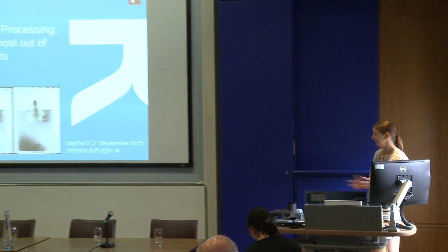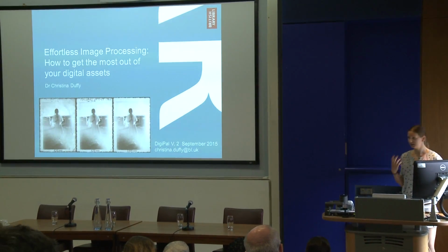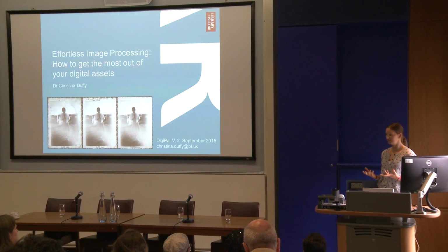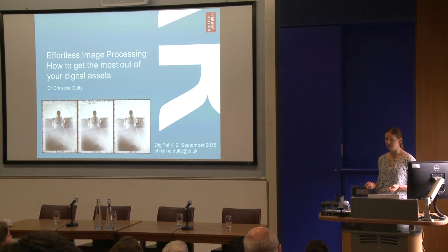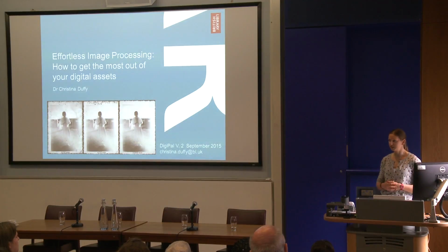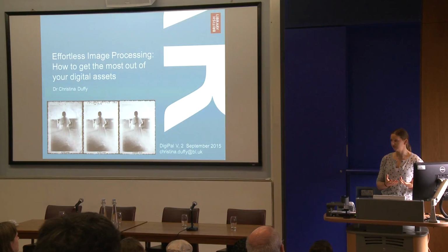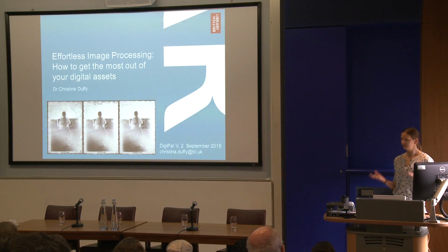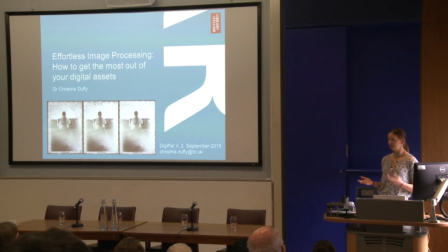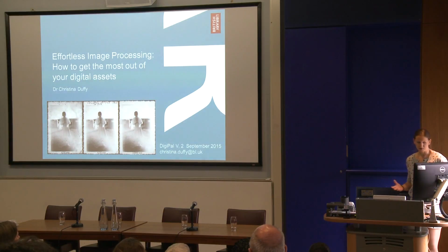I'm Christina Duffy, and as the imaging scientist at the British Library, most of what I do is multispectral imaging and microscopy of the collection items. And what that does is generate huge amounts of digital data, and then it's up to me to present that in different ways depending on what the researchers or the curators are looking for, or if the conservators have a particular interest in the physical aspects of the collection items, then we would do condition assessments of the items before and after. So a lot of what I do is actually capture, but some of it is processing as well.